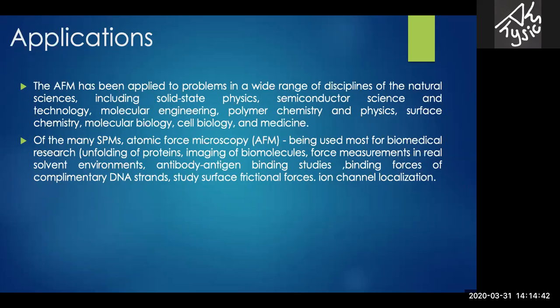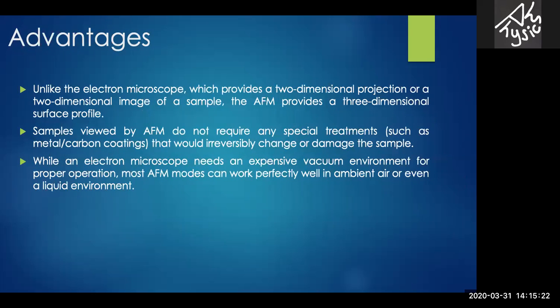After many SPMs, atomic force microscopy is being used most for biomedical research, such as unfolding of proteins, imaging of biomolecules, force measurements in real solvent environments, antibody-antigen binding studies, ligand-receptor binding studies, binding forces of complementary DNA strands, and study of surface frictional forces, ion channel localization in the field of biomedical engineering.